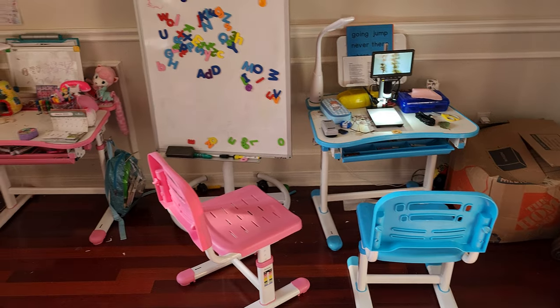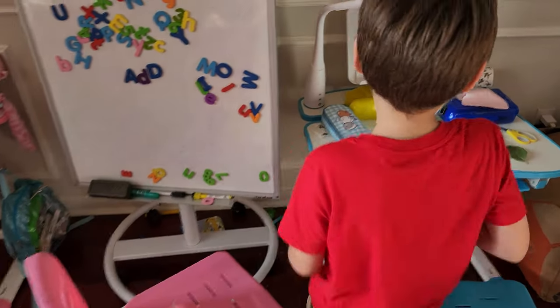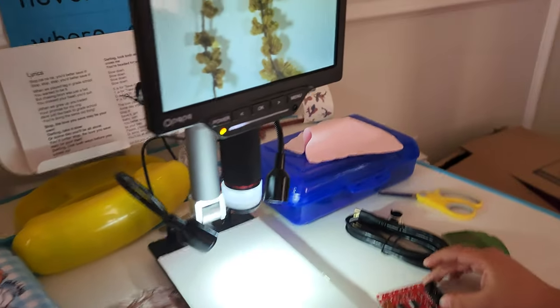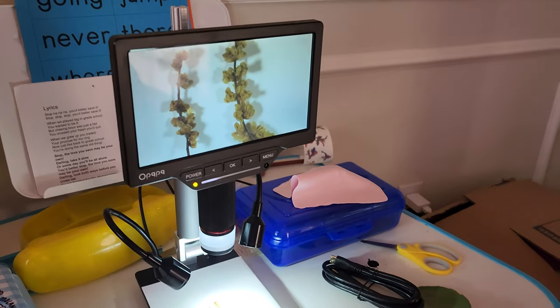Hey guys, I'm just doing a little demo of my digital microscope. It's an excellent opportunity to show my kids what a microscope is and what we can observe that isn't normally viewable to the naked eye. And my son showed me a feature about the microscope I didn't realize. So let's go ahead and take a look. Over here in the corner of my house, I've got it set up for my son and my daughter for their little educational area. I brought the microscope over — what a cool device for showing them little aspects of the world.